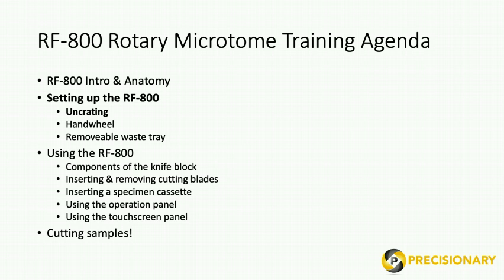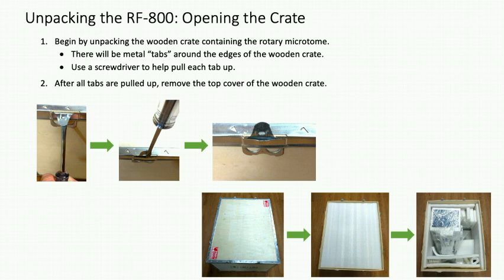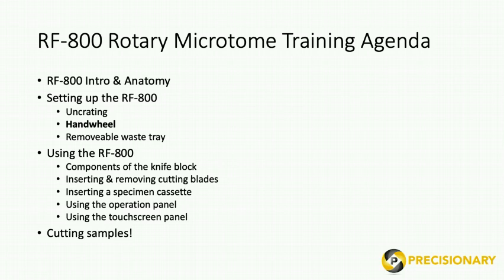Now let's focus on unpacking and setting up your new microtome. When your microtome arrives, it will come in a wooden crate by freight shipment. Begin by unpacking the wooden crate by using a screwdriver to pull up the tabs around the edges of the wooden crate. Once the tabs are pulled up, the entire top can be removed. Then, simply unpack the contents inside. Set up your rotary microtome on a level table or laboratory bench.